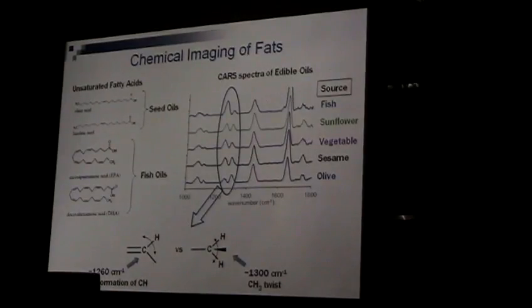So what I did was, my wife actually likes to cook a lot, so fortunately we have lots of different oils. Except for this fish oil, which is actually a gel from CVS, we just plugged all the oils I have into my microscope and looked at the spectrum. This is what I got. Basically, these are their Raman spectra, right? These are just giant alkyl chains with a carboxylic acid.